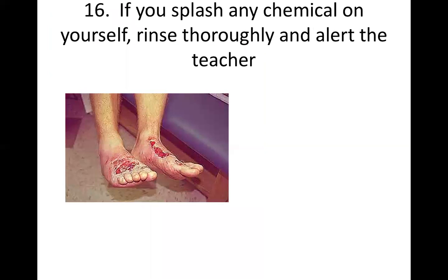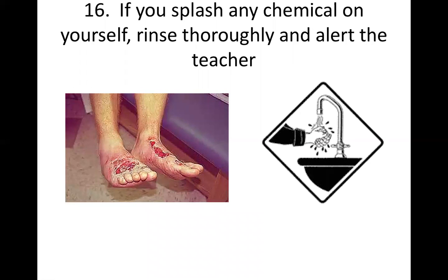Again, like we said, we discourage open-toe shoes or sandals or slippers inside the laboratory. And the reason is because some chemical spillage can splash to your feet. So in case this happens, if you can see there are burns on the feet, because most probably it's an acid, you have to wash it thoroughly in the shower, not on the sink. You do not put your foot on the sink. You use the shower, then after that you go to the clinic or a hospital. Okay, so in case this happens, of course, you have to inform the teacher so that the teacher can assist you in the shower or can inform the admin to bring you to the hospital or to the clinic.